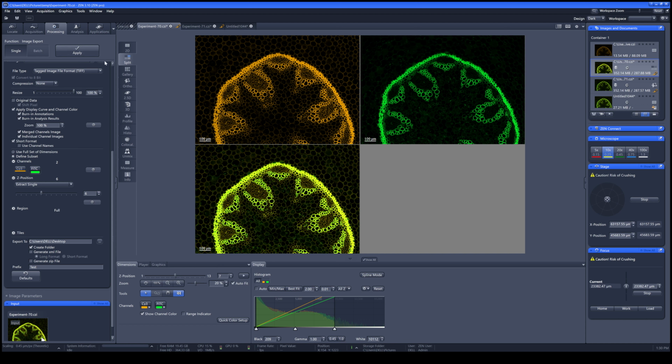From now, the only image that I've got will be just one single channel of FITC from the Z-stack number 6.